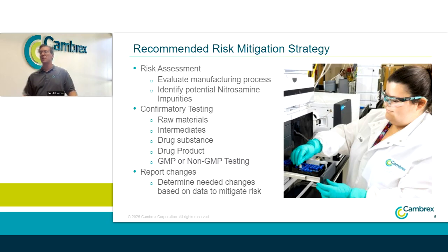And that initial assessment, the testing can be GMP or non-GMP. Non-GMP testing can be done with a method that's demonstrated suitable for its intended use. And based on those results of testing, changes may then be required to mitigate the risk of nitrosamine formation in either the drug substance or drug product. And each step offers an endpoint in assessing the nitrosamine risk for your drug product. So we'll discuss each of these steps in depth and demonstrate how Cambrex has helped its clients meet FDA and EMA requirements for the nitrosamine assessment.